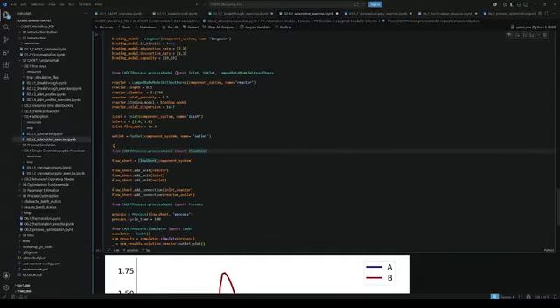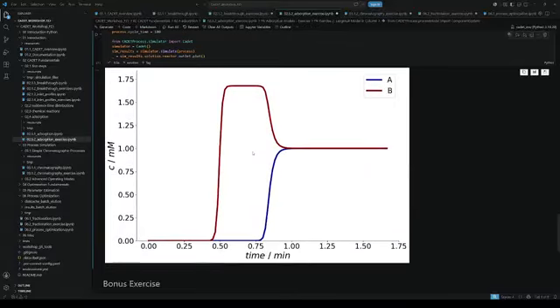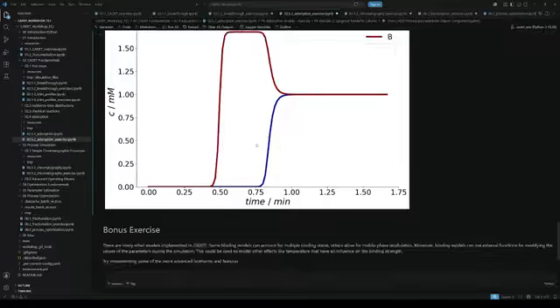Again, obviously now we can play around a little bit with these parameters. If we make this even stronger, the peak is going to be even sharper, right? So in all of this region, no component A is eluting from the system, is coming out of the column. It's all just B. So this is all just molecules of B that have bound in the beginning to the column that are now being replaced with A, and therefore A is eluting much later than B.